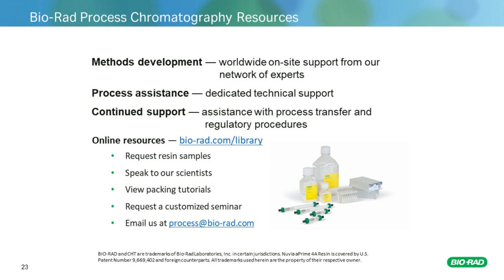This is a great question. It actually depends on what you are adding. On the other hand, the ones I'm showing today are very common ones that we've seen in approved commercial production processes. But if you have a question about a particular additive that you have not seen in this presentation, feel free to contact us, and we are going to investigate it together with you.